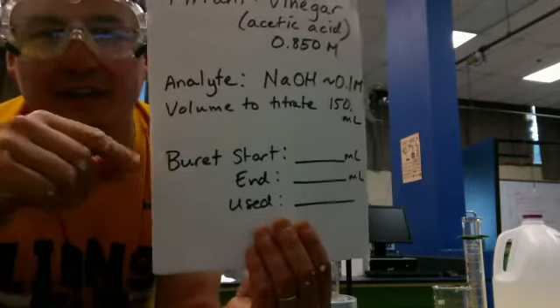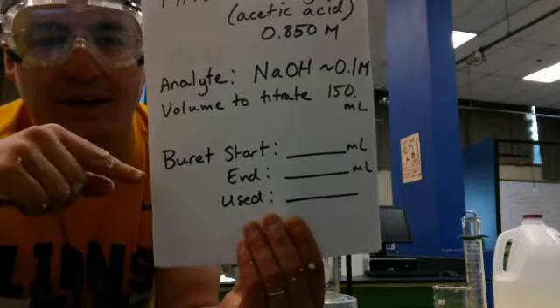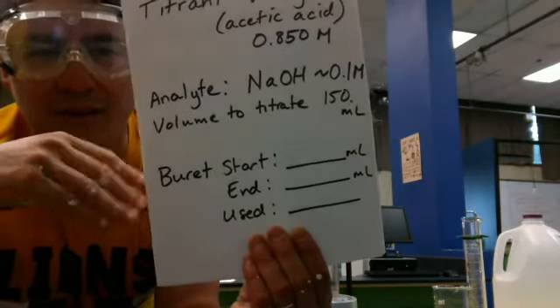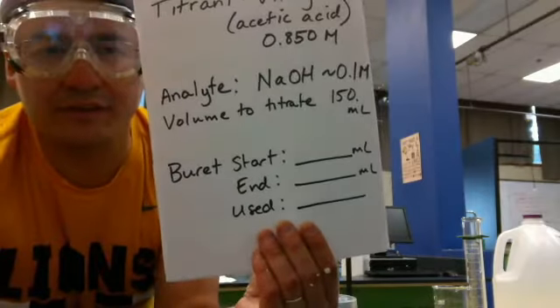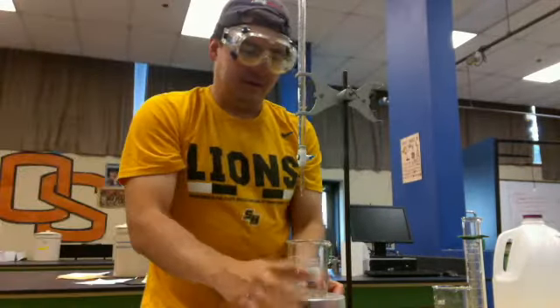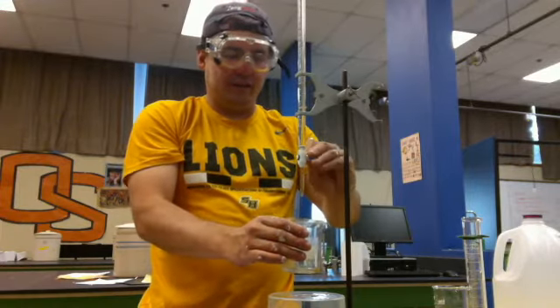And instead of titrating a small amount, I can be much more precise if I titrate a larger amount. So I'm going to titrate 10 times as much as you guys did. So it should roughly take about 10 times as much vinegar as you guys got in your results because I'm just doing a larger volume of it. And then you'll note I've just got a burette start and ending that I'm going to fill in so you guys can see. So this is the process of a titration. So see if you can follow along. I've got vinegar in the burette.